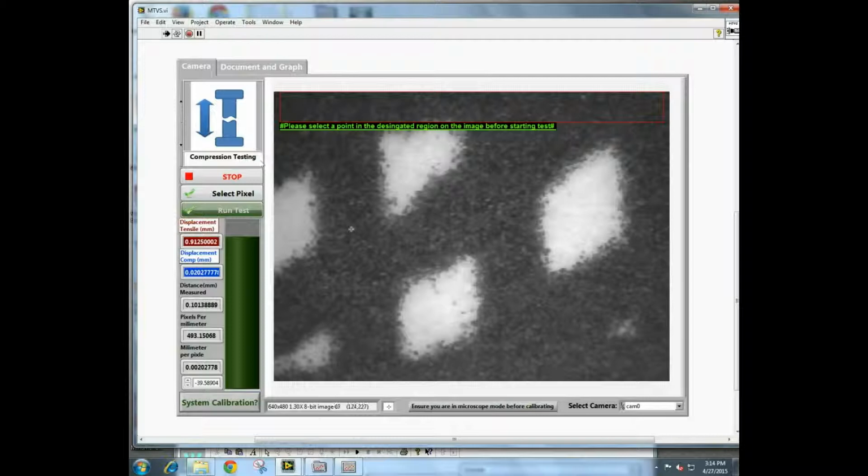The background media is the upright strip on the gantry. Before we run the test, we have to select a pixel, and as you can see, the particle is written to a pre-designated coordinate on the image, and it will move in a downwards direction.